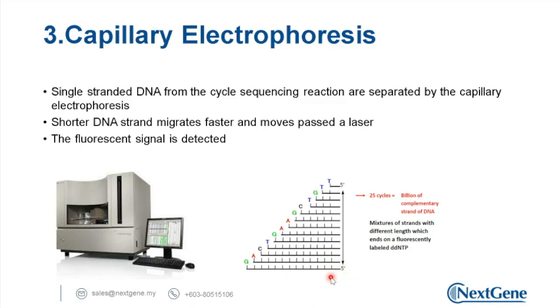But we are giving 2 different reverse primers. Oh, okay, so one over here and the next one over here. In this case, because one sequencing event actually succeeded, I think the next one should succeed as well. But this is what we get. One of the reverse primers is good, but the other one has a lot of noise. So that's why I just want to confirm whether our sample is not enough.